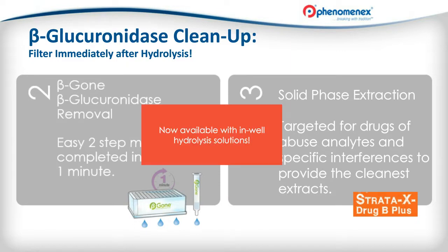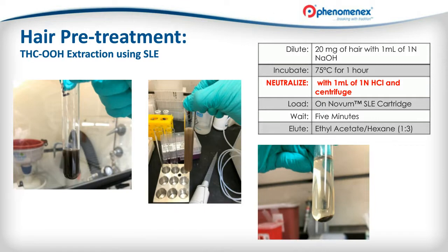Okay, this is something that I wanted to mention since we're still talking about pretreatment. I think maybe based on the fact of how much I've been talking about pretreatment, it leads me to my kind of dumb, I guess, comparison that I feel like sample prep in general is kind of like painting a room in the sense that you spend more time putting down the cloths, taping up the walls, making sure that you don't get paint everywhere. You spend a lot more time doing that than you do actually painting, and that's kind of the same thing with solid phase extraction and just sample prep.